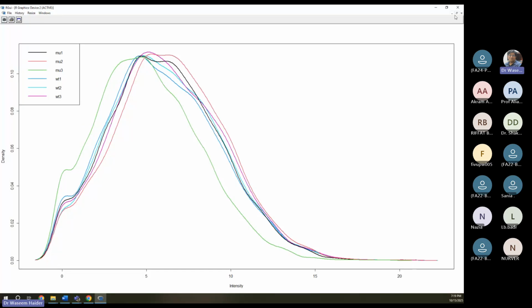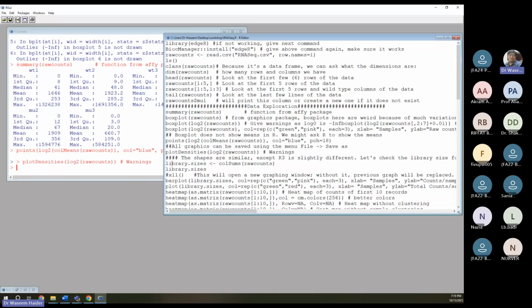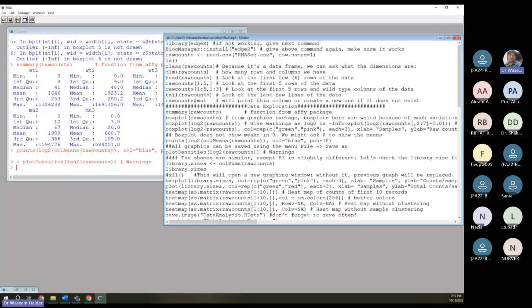So as we can see from here as well. And then comparing those curves is a little bit hard. Comparing those box plots was easier. So that's why those box plots are there. And most data analysts, including myself, love box plots. Okay, so we reach here.